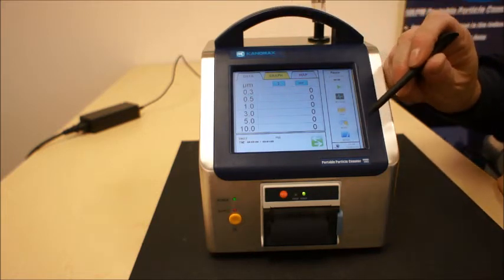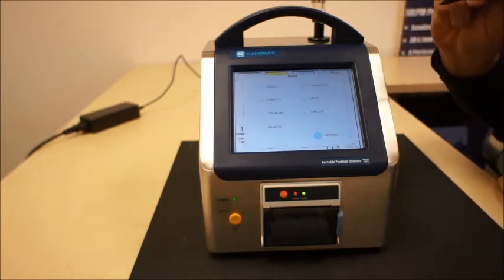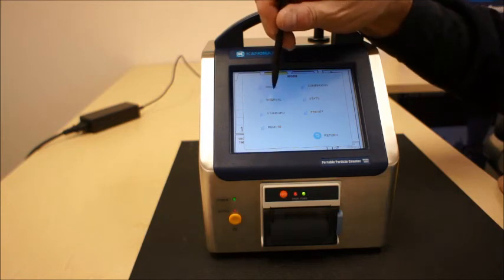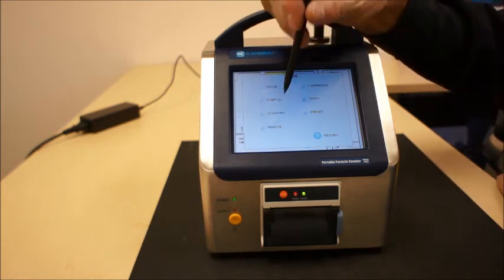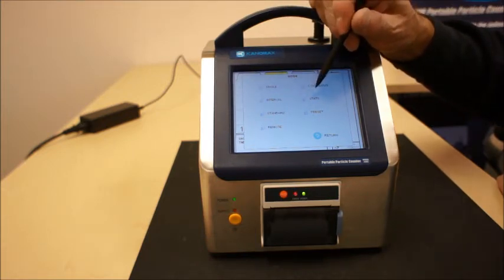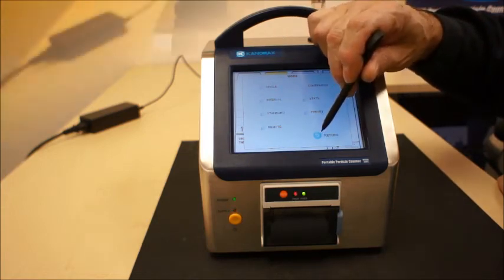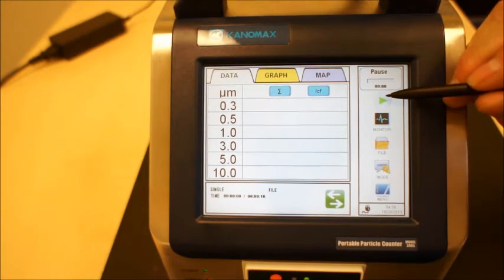The unit itself has a difference in modes. You can do single channel, you can do intervals, you can do a standard count, you can do a remote count, you can do a continuous count, and then look at your statistics and have presets. This is representative of a single count in a standard mode.